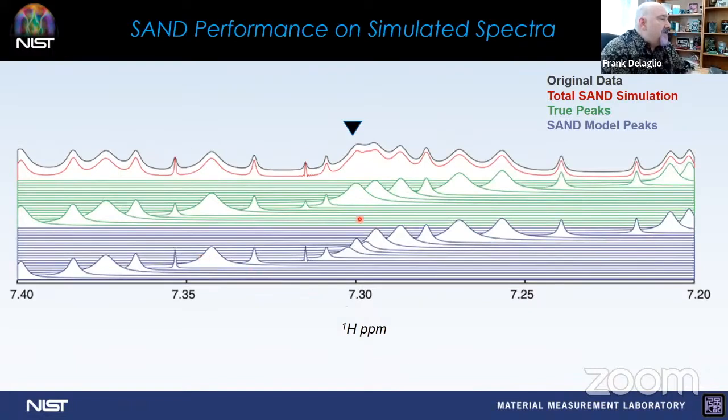Here's another case where this peak was decomposed into three smaller peaks. This is expected in spectra where there are several hundred or several thousand overlapping peaks. And this issue makes it very difficult to compare the effectiveness of one optimization method over another.